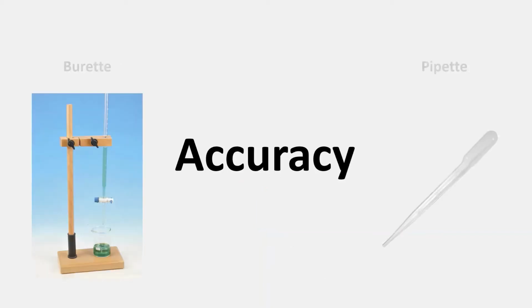Now, one quick word about accuracy. Whenever you measure something, you want to use an accurate tool, and typically a titration is carried out with a long glass burette, and that has a tap at the bottom and very carefully measured graduations so that you can do very accurate additions of small volumes of liquid or aliquots.